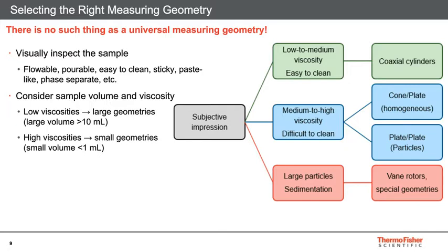A vane rotor to me looks more like a boat impeller. Okay, it has blades on it. Those blades actually grab onto these larger particles or these thick samples, and are able to shear them. Okay?